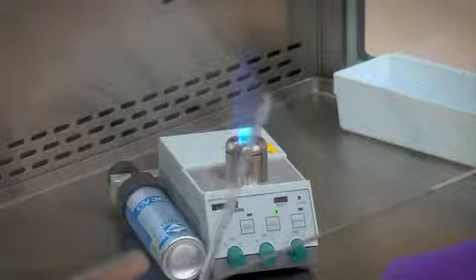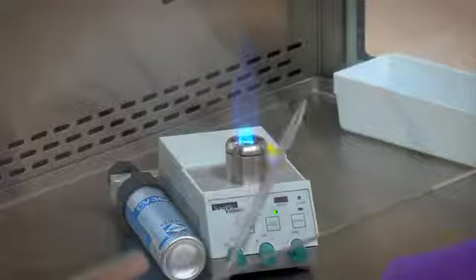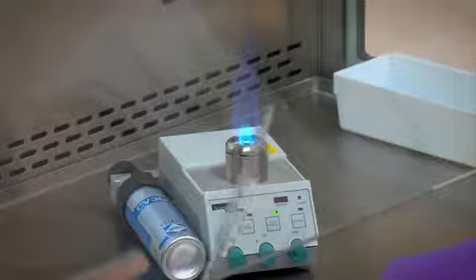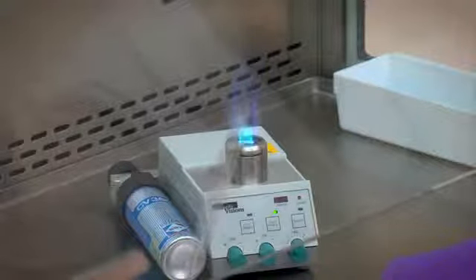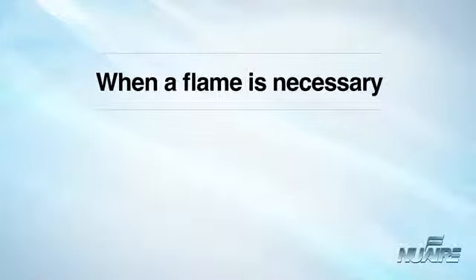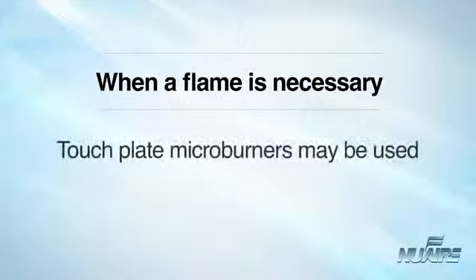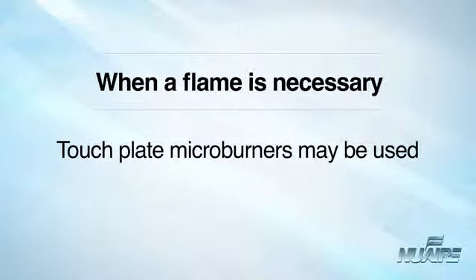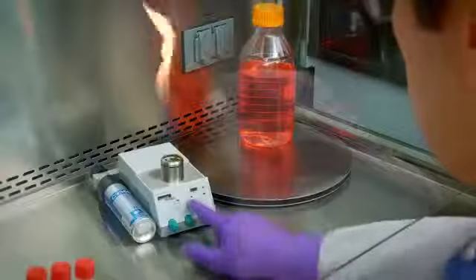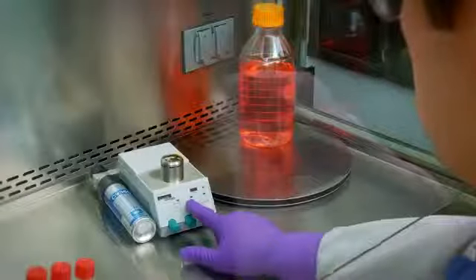An open flame in a BSC, however, creates turbulence, which disrupts the pattern of air supplied to the work surface. When deemed absolutely necessary, touch-plate micro-burners equipped with a pilot light to provide a flame may be used. This will minimize internal cabinet air disturbance and heat buildup. The burner must be turned off when work is completed.